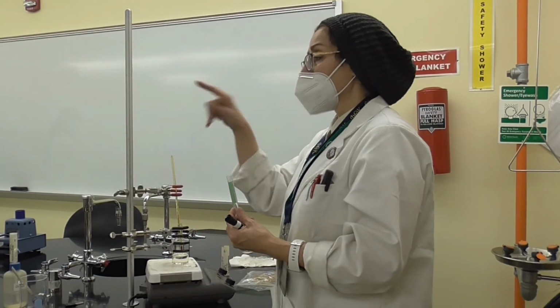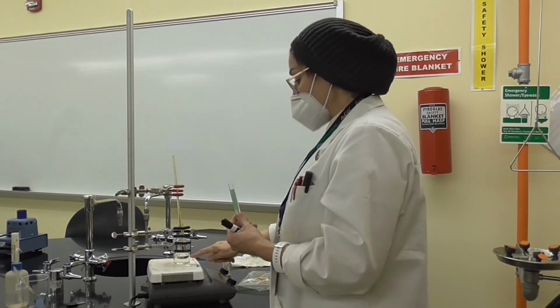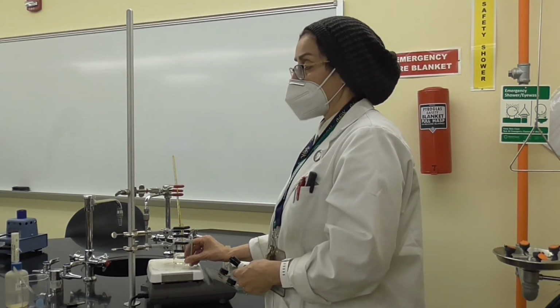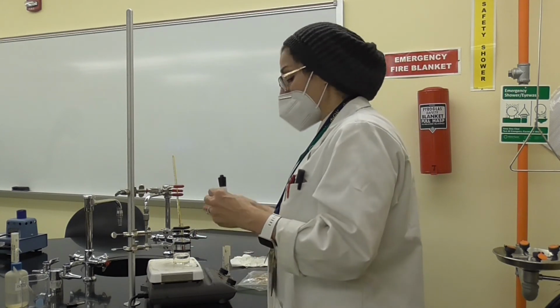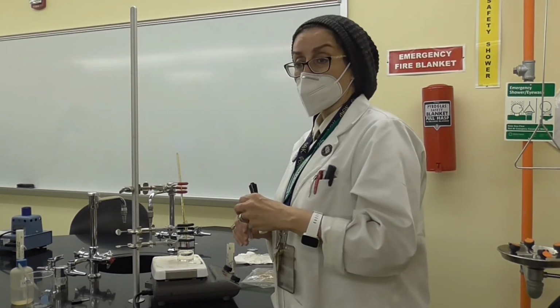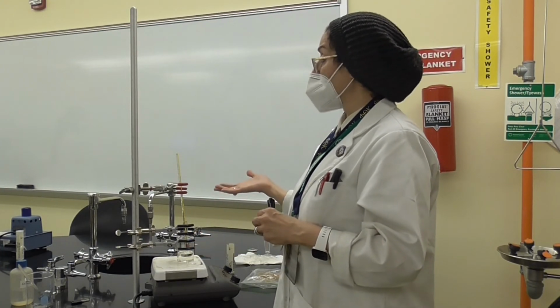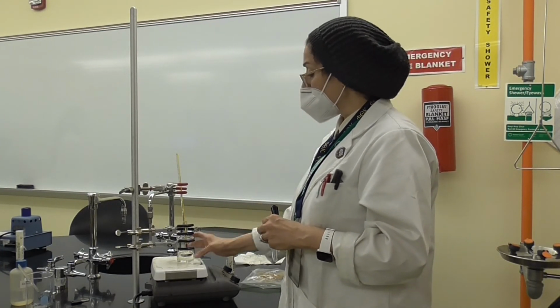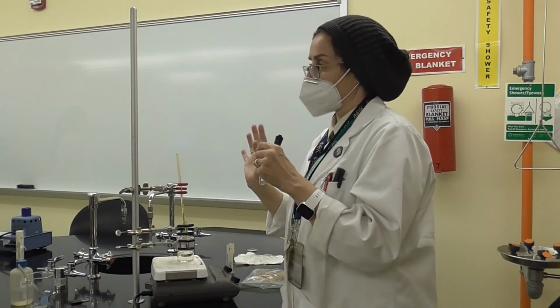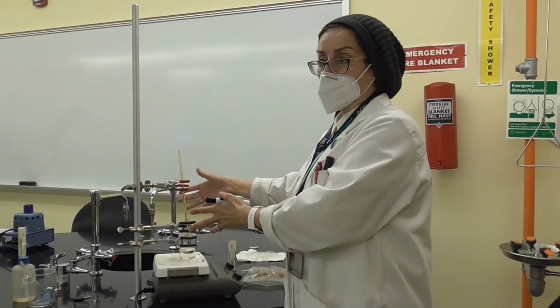Although I was reading the book and showing you in Technique 7 that this test tube will be directly on top of the hot plate, we can do that, but I don't want any splash or inconvenience with the procedure. Therefore, it is much safer to use a very heavy paraffin oil, mineral oil, and when it heats, it is going to heat the organic liquid. So this is how we are going to set up our own apparatus.